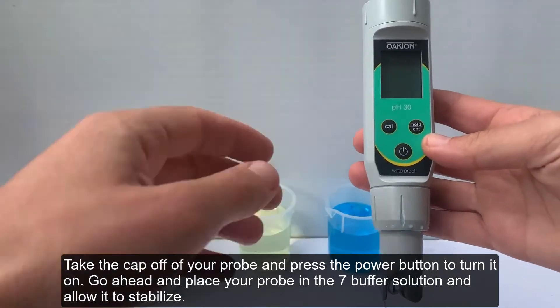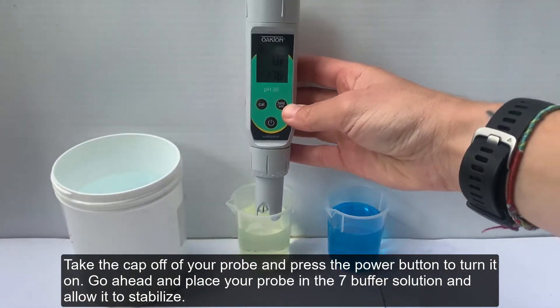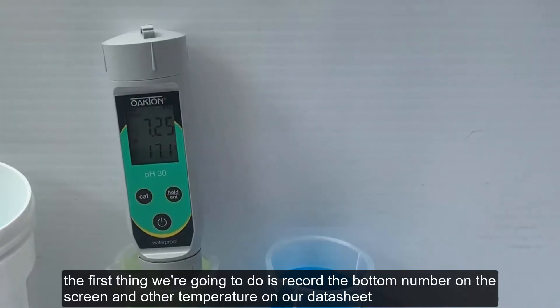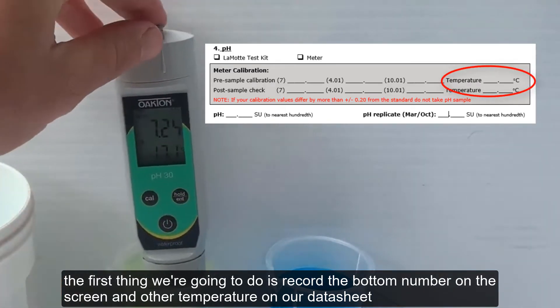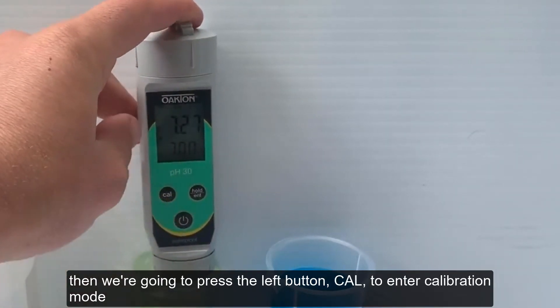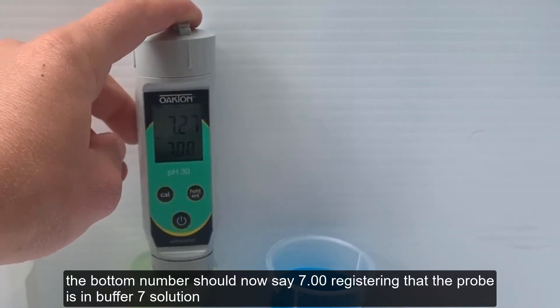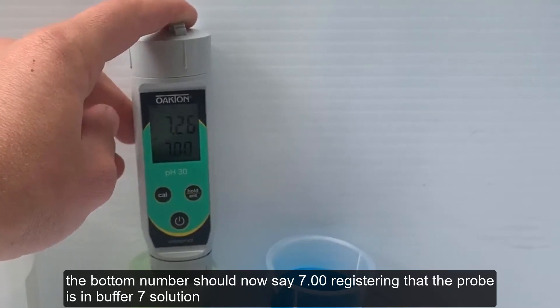Take the cap off your probe and press the power button to turn it on. Place your probe in the 7 buffer solution and allow it to stabilize. The first thing we're going to do is record the bottom number on the screen as our temperature on our datasheet. Then press the left button, Cal, to enter calibration mode. The bottom number should now say 7.00, registering that the probe is in buffer 7 solution.